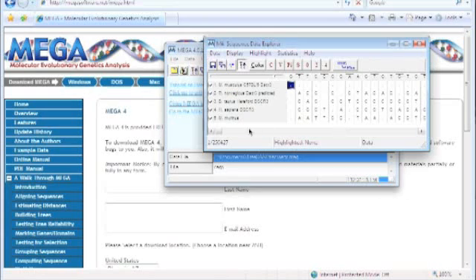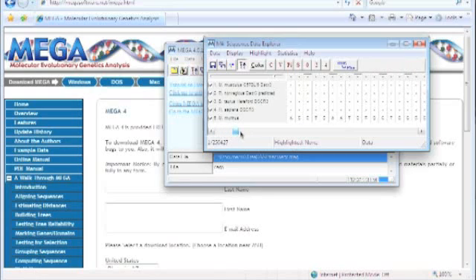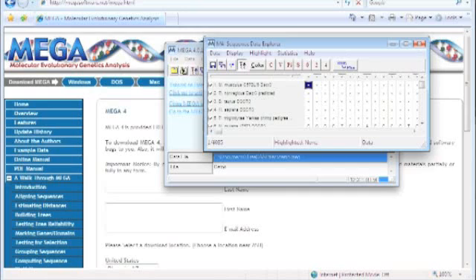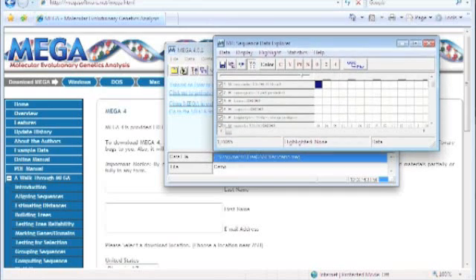Alright, and here we have the same thing without the fancy colors. Now that we have this open, this has a lot of different colors and information you can learn about.